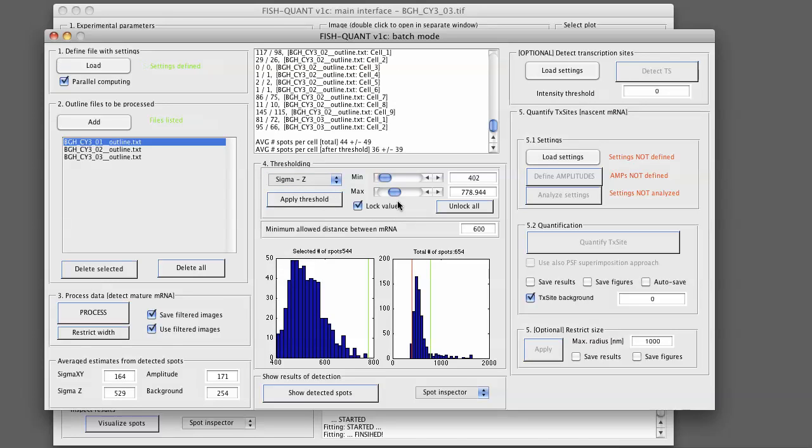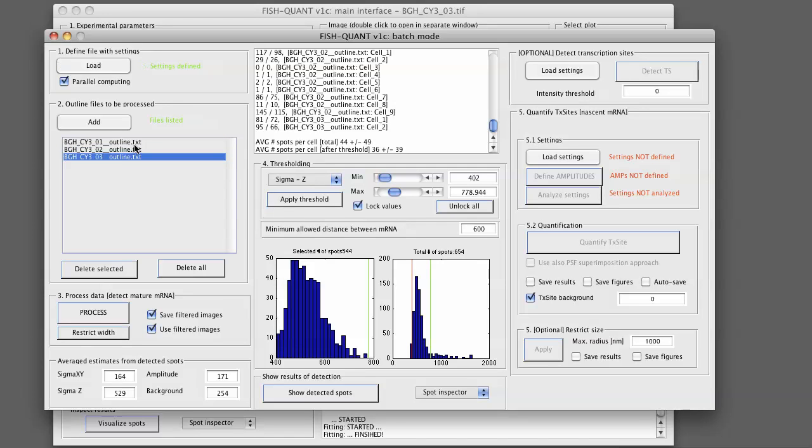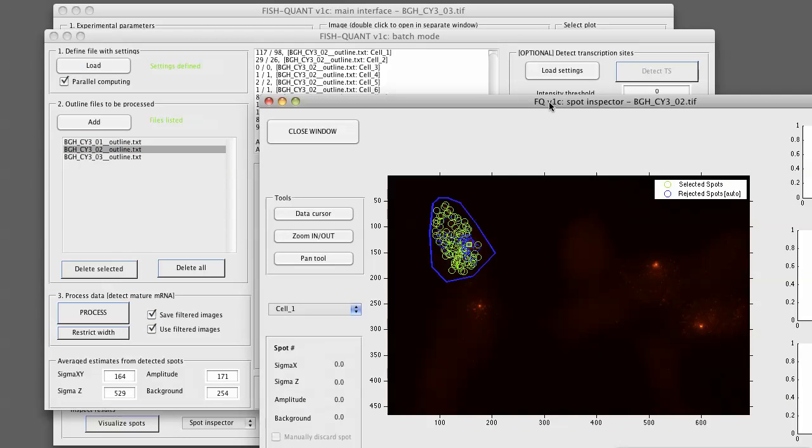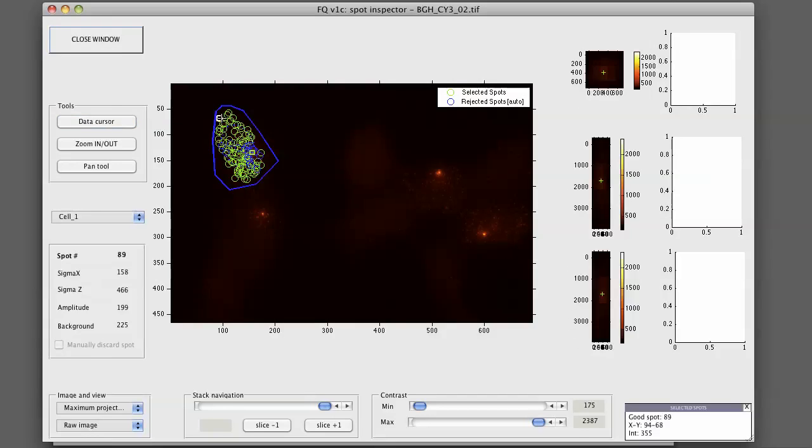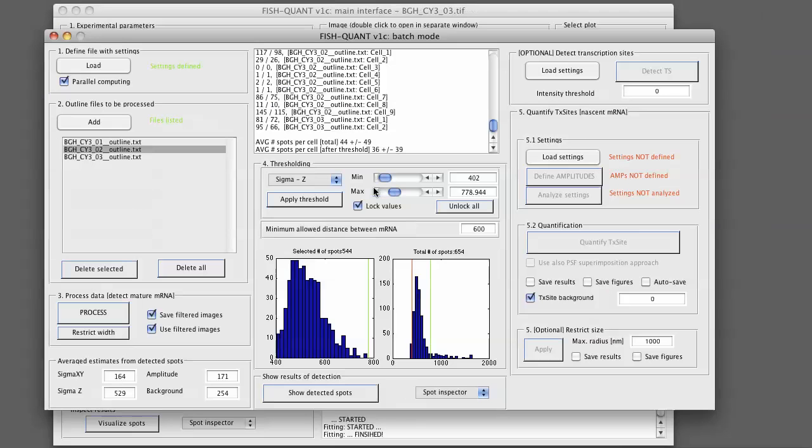What we now can do is we can also inspect the detected spots as before. So you can just simply select here one of the outline files that you want to look at. You go to show detected spot and the same window as before will pop up. The difference here is now that in the data cursor, you will only see the spot that was fit, but you will not see the fitting results. We do not store all of this in order to save memory. You can close this window.